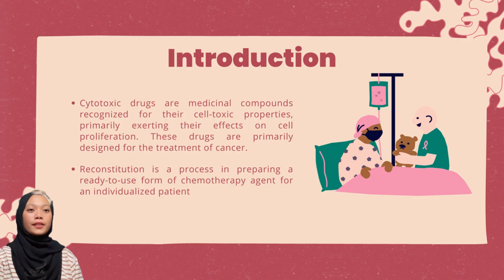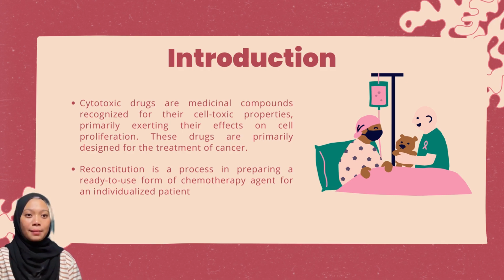The reconstitution of cytotoxic drugs stands as a critical and delicate process within the realm of healthcare, playing a vital role in ensuring the therapeutic potency of this medication while simultaneously mitigating potential risks. Cytotoxic drugs, often employed in cancer treatment and other severe diseases, require precise preparation to achieve the appropriate concentration for administration. These introductory steps involve the meticulous mixing of these potent substances with specific diluents, demanding strict adherence to established protocols and aseptic techniques.